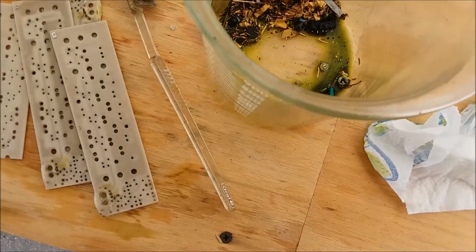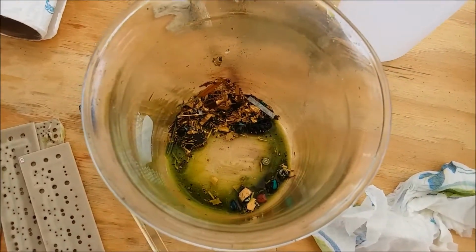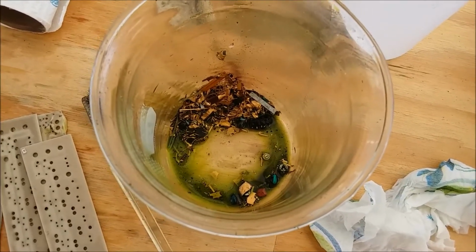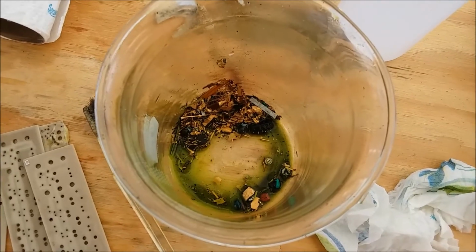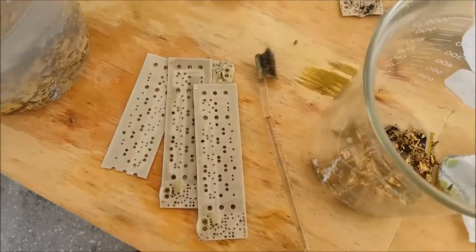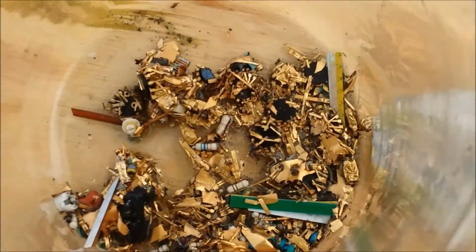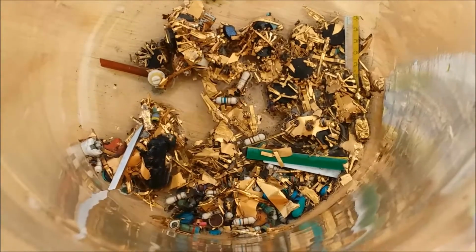I need to rinse some of this nastiness out of there, and see what we've got. It looks like the majority of the base metals are gone, but let me rinse it and get a better look at it. Okay, so here's all the stuff that's left in the bottom of the beaker after rinsing, and it does look like pretty much all the base metals are gone.